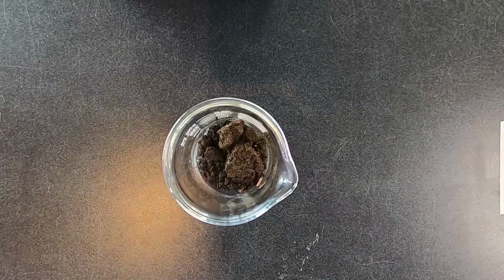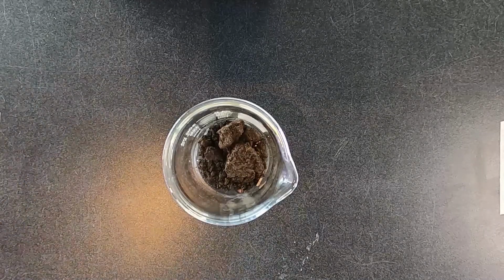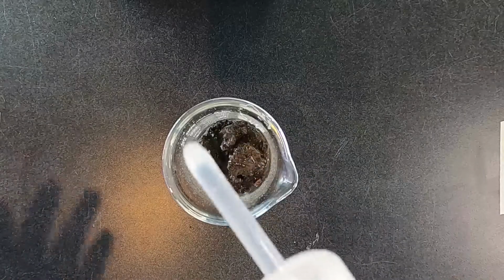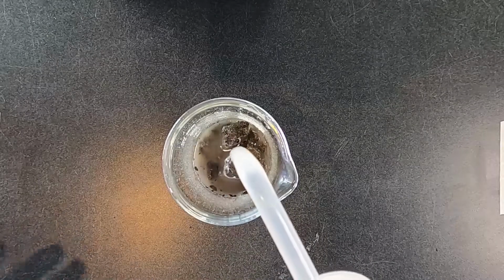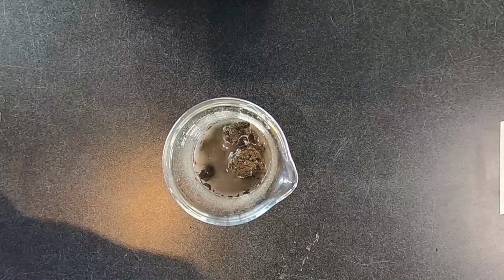Now, we're going to actually top it all off by using a little bit of this distilled water. We have to use distilled water to top this off because distilled water has a neutral pH of 7 and it also doesn't contain any contaminants. So all those contaminants could actually affect how well or how poorly it will do on this test.